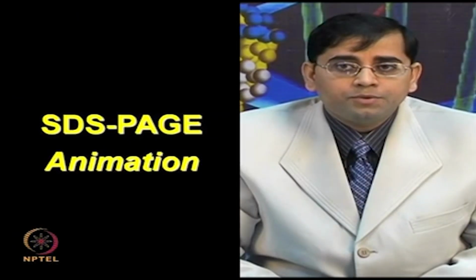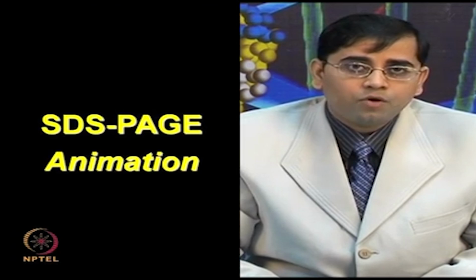Then we have different wells, and in each well, the unknown protein for which you want to determine the molecular weight can be loaded, and after staining with Coomassie blue, you can see a pure band here in this case. So, one can determine the molecular weight by performing SDS-PAGE. I will now describe the animation and show you the steps involved in SDS-PAGE.